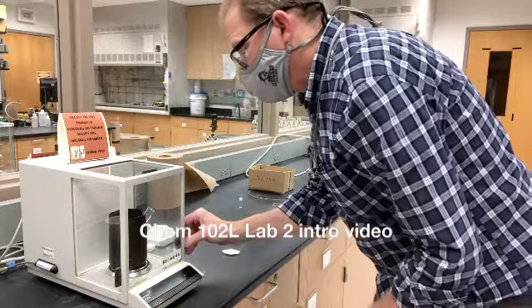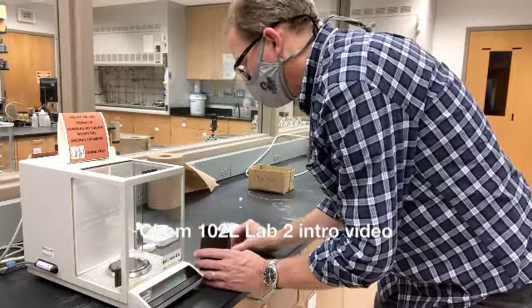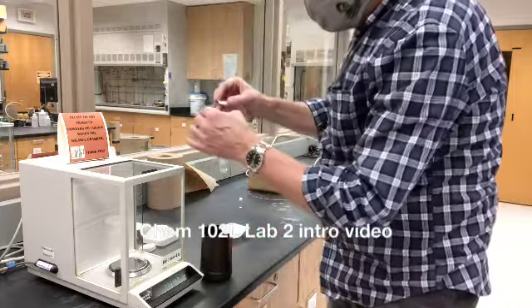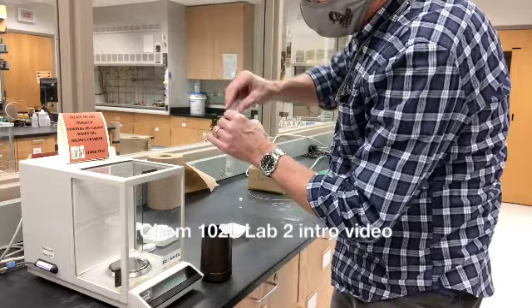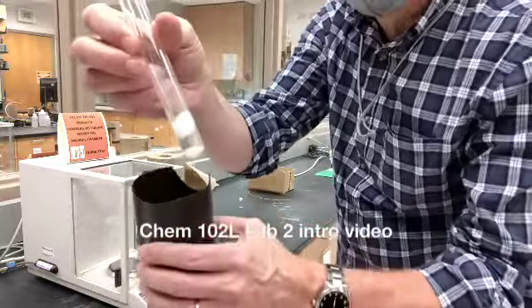Got zeros, and now I want to take my little boat and pour this in. Now I'm going to do this so it's kind of vertical, and I'm going to pour it straight down. And now I've added my mass to this.